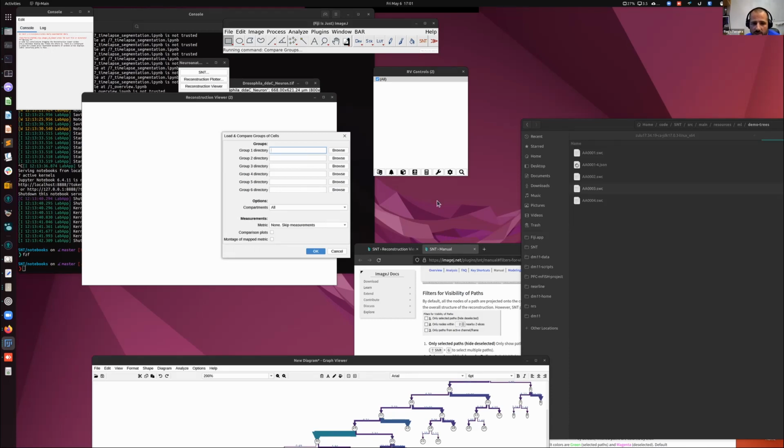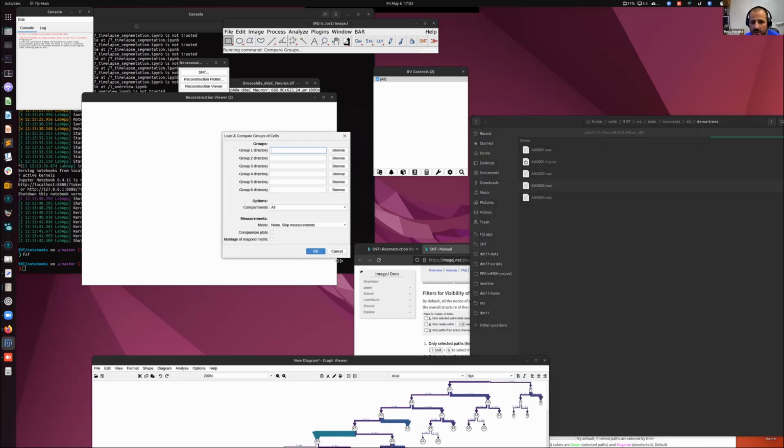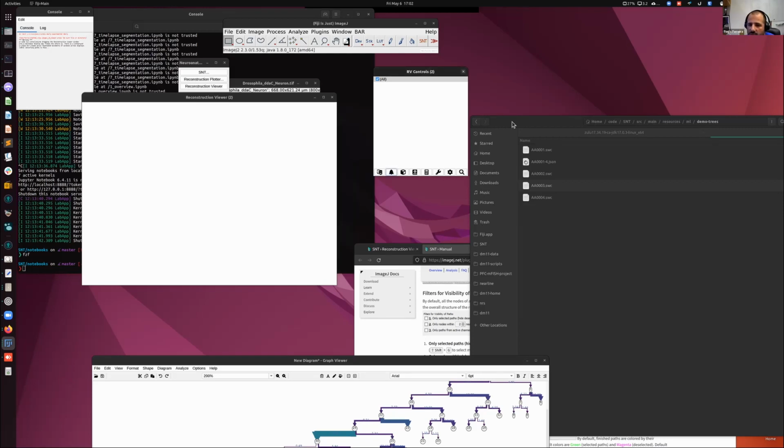So we could try that also if you are interested on that. So the idea is that you load everything, the groups get segregated, and you're going to have some box plots, some histograms describing the two populations, which could be useful. And there is also an option for some t-tests that are performed by default.